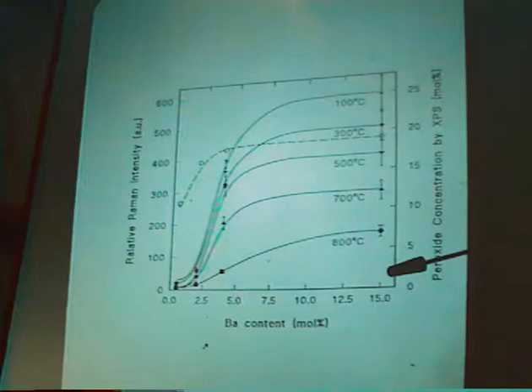But as far as I'm aware, this sampling depth for the Raman spectrum needs to be addressed in more detail so that we may have a better understanding of such phenomena as I've just described.